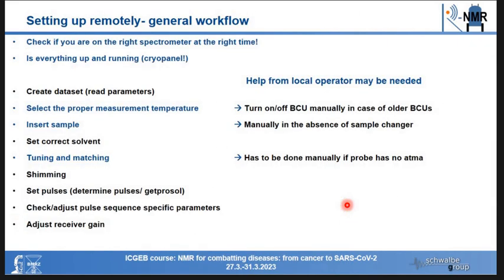Genau. So as I said, I will dwell a little bit on what is important if you set up an experiment remotely. If you want to do that, and I really want to emphasize this, if you have lots of spectrometers, first check that you're really on the right spectrometer. If you walk into a room, you see directly, oh, this is my spectrometer. But if it's only a computer, the remote screen always looks the same. So make sure that you're on the right spectrometer and don't stop anybody else's experiment.